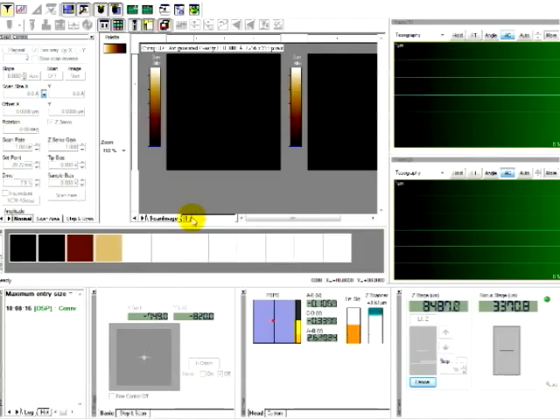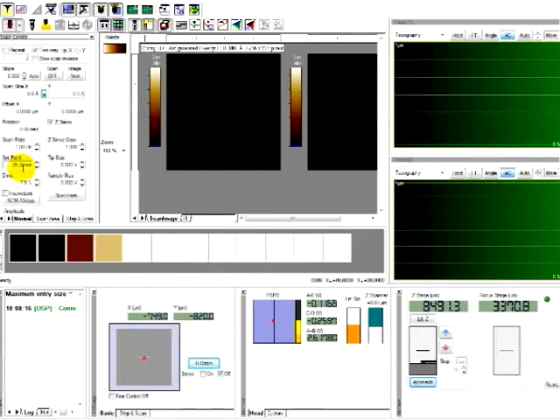For non-contact mode, there are 3 major parameter settings that you need to do: first, scan rate, Z-servo gain, and set point. It is a little bit hard for beginners to control set points, so we have another technique called double approaching, which is after you first approach, you can click on the Z stage up just a little bit until the Z scanner goes down. So in the topography signal, you won't see any signals.